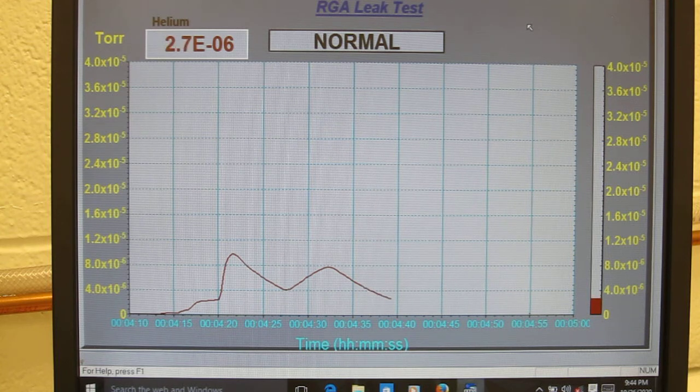Now once again, be very careful, because if I waft helium at an O-ring, you'll notice that it'll very, very slowly increase. If it does this, it's permeating right through the rubber.